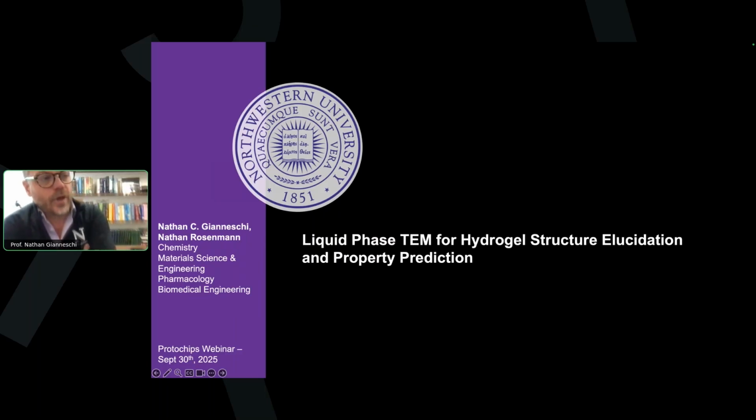One of our long-term goals when we kicked this off, about a decade ago, was to study hydrogel structure. This presents a challenge if we look at, say, a dried-out gel architecture for a number of different reasons. The predominant one, and this is general to other kinds of structures like this as well, is that this architecture itself is dependent on its solvated state. And that would mean necessarily that you must have changed it during processing, breaking up the gel, for example, to examine it by even cryo transmission electron microscopy methods.